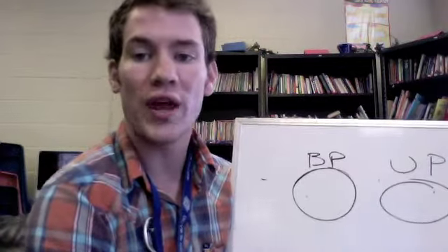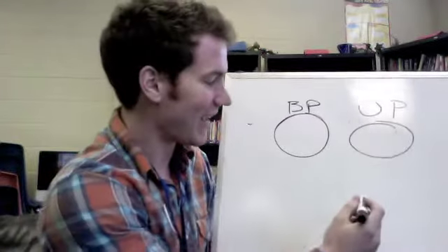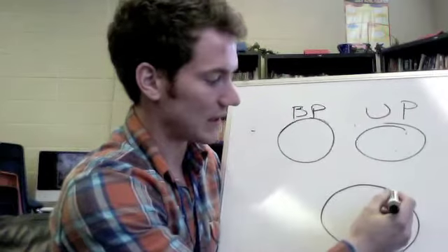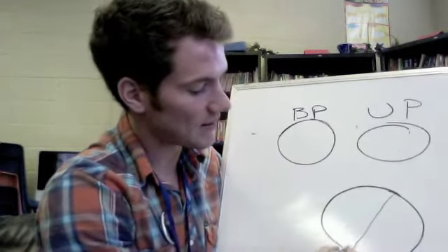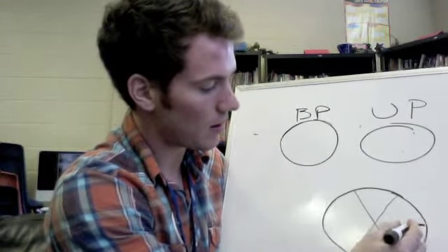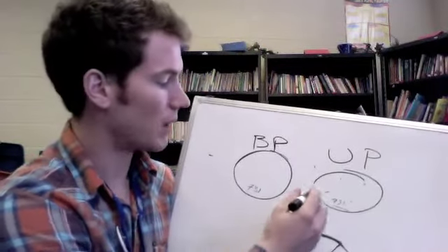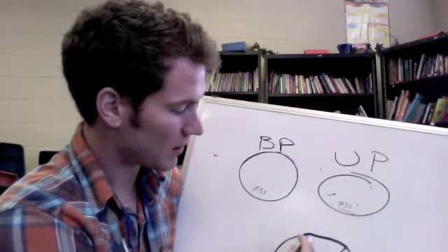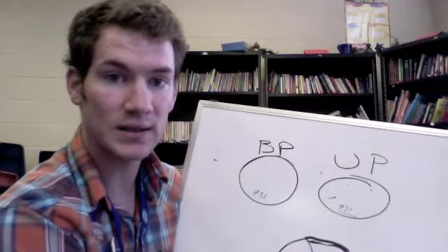We'll grow up some colonies on each of these. And then we'll take a colony from each of these and we'll put it onto our selective medium. On the selective medium, on the back side of the plate, we'll divide it into sixths, just to keep track of where we are. We'll take one of these colonies here, take it off this plate, and streak it right across the top here one time with our sticks.